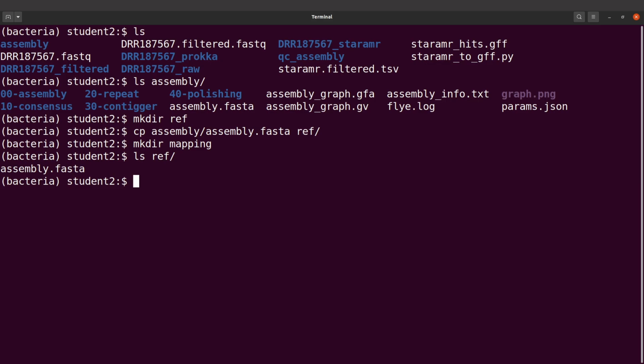All right, so let's run minimap2. So I'll say minimap2 -ax map-ont, and I'll say -t, that's the number of threads. So here I'll use 6, but you can use 8, 10, or whatever you have available. If you have more than 10, you can specify it.